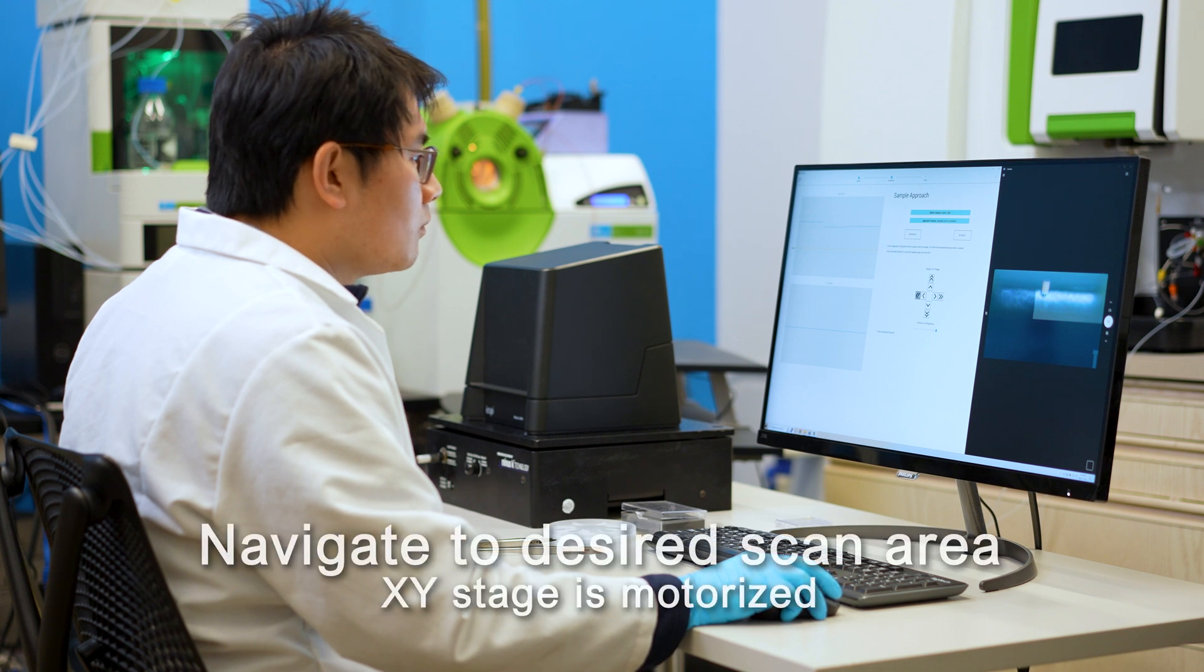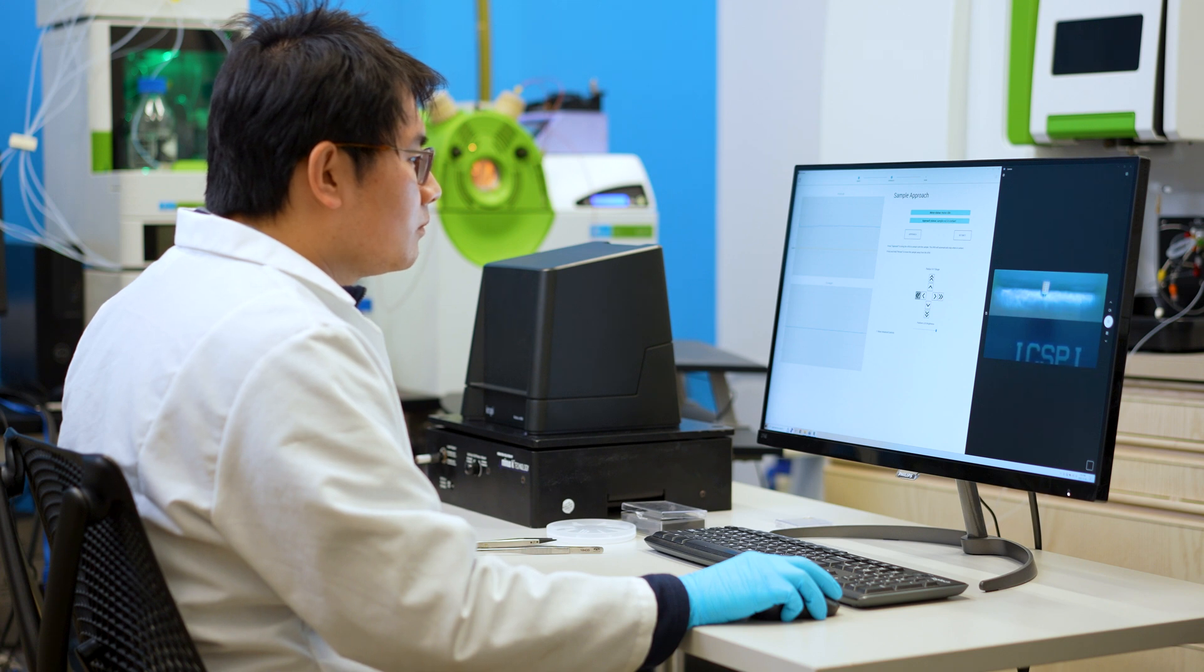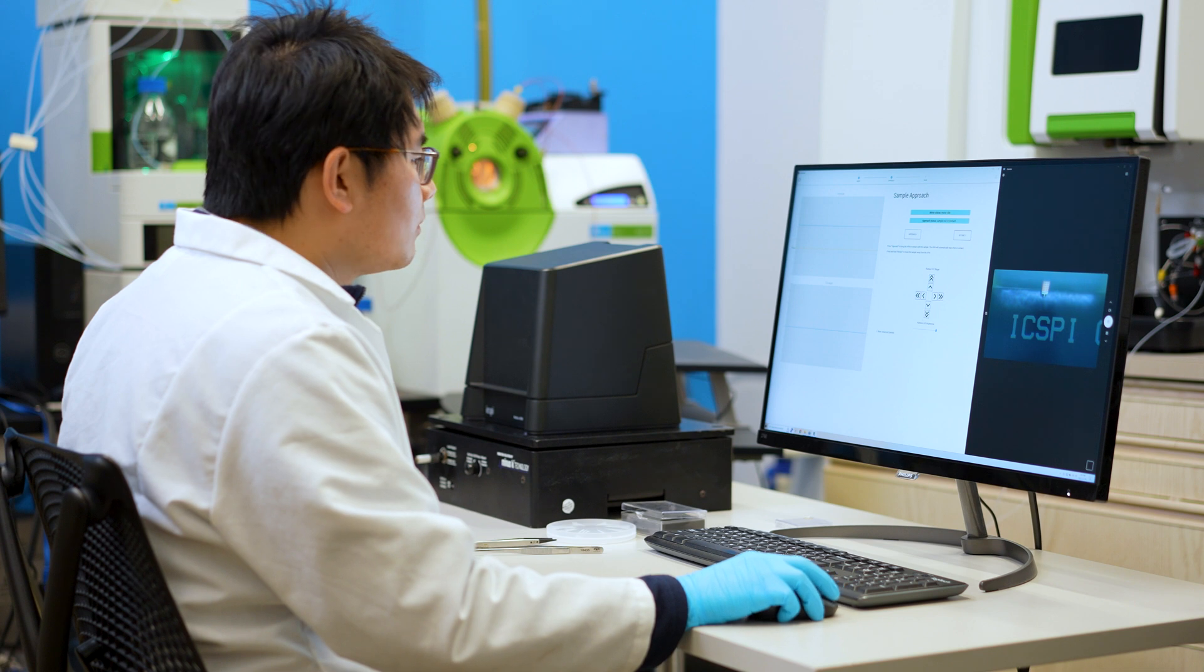Navigate to where you need to scan with the motorized XY stage. And by the way, it's pronounced IC Spy.